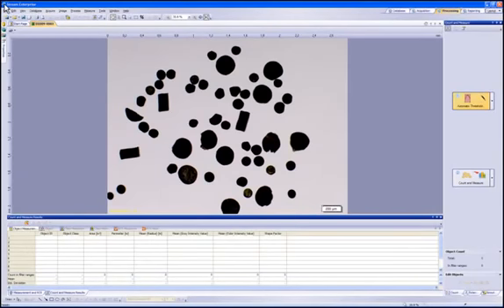Once you have your image captured with the particles to be counted clearly defined, you will need to interface with the Count and Measure tool window within the processing layout. First, you will need to set up the threshold for your image. Threshold is the software's ability to distinguish between intensity values or color values to mark them against a background.